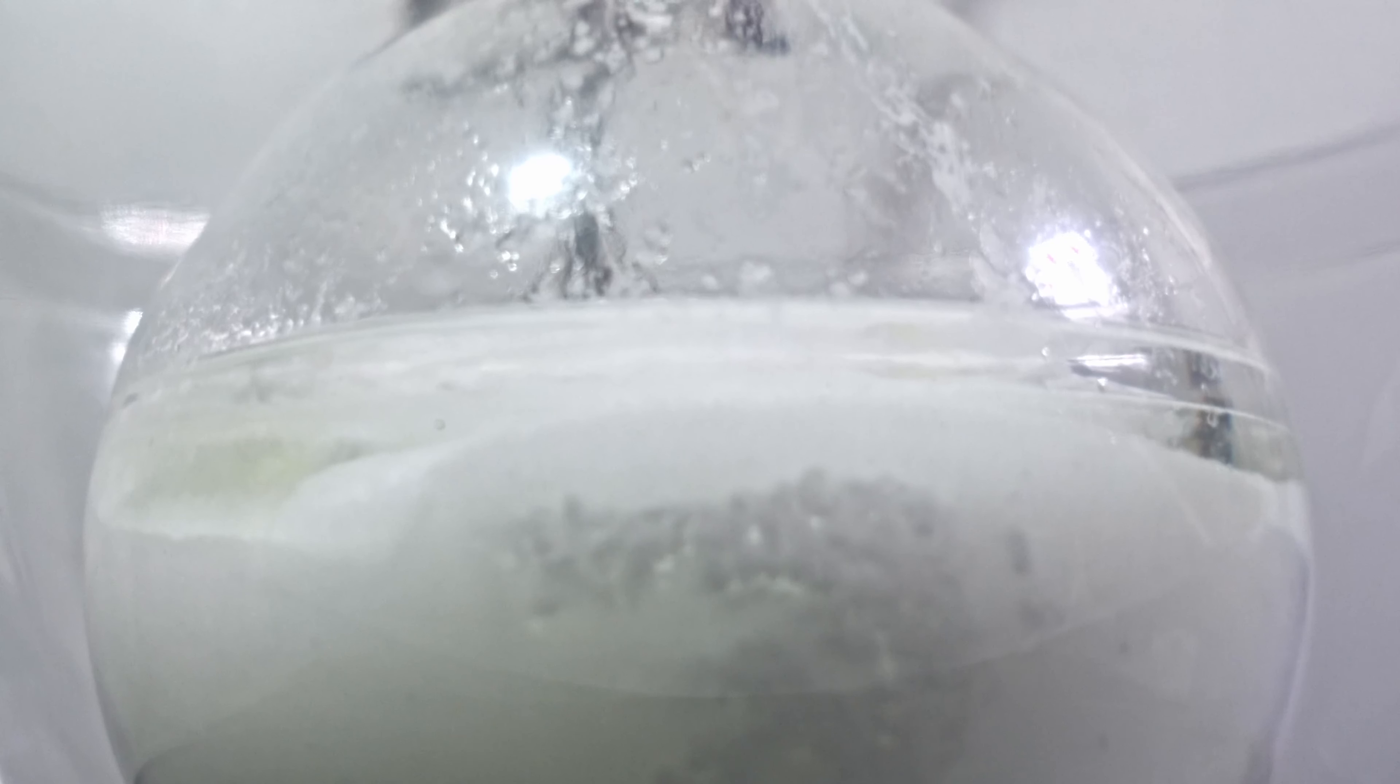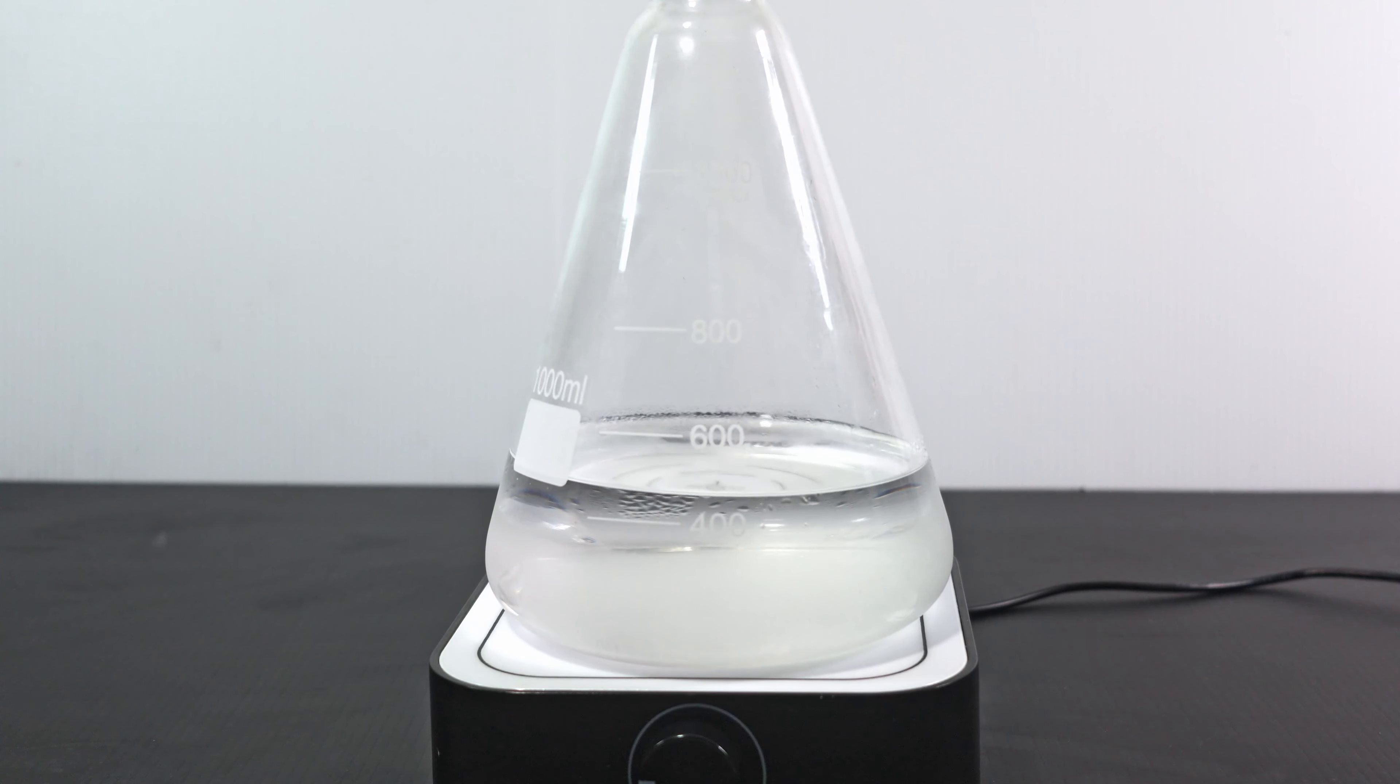And what do you know? Some tert-butyl chloride does come out of solution. In all, I got a little over 400 ml of crude tert-butyl chloride.